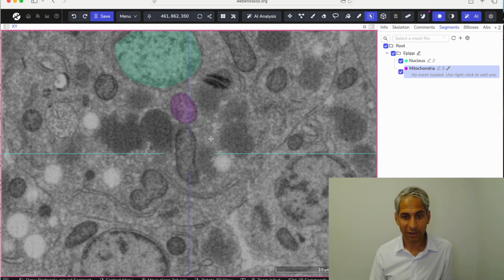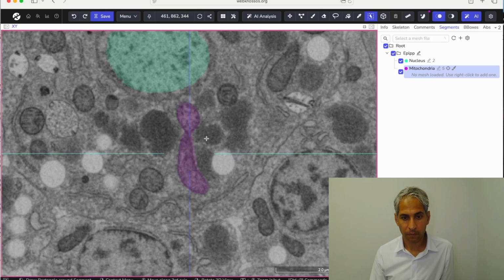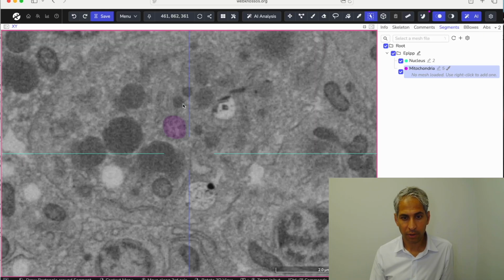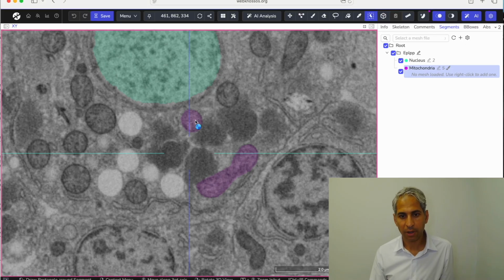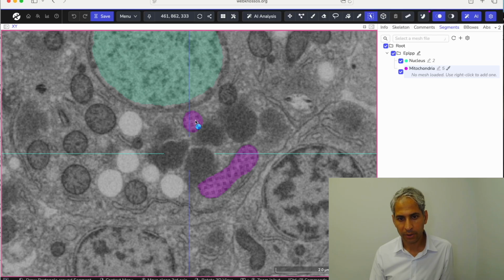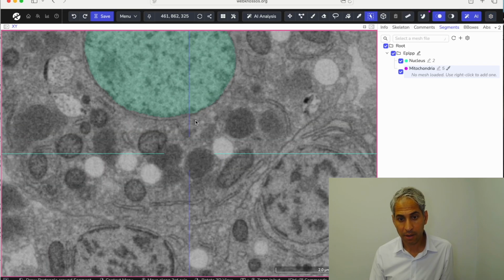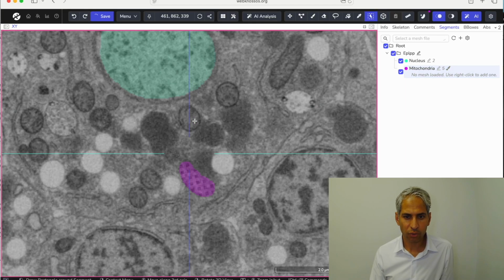Try to guess what it's going to look like. Okay. Oops, I saw this may be long. Oops, I'm not going to go there. This is part of the mitochondria. This is part of the mitochondria. The same mitochondrion, but it definitely looks like a branched noodle, I think.